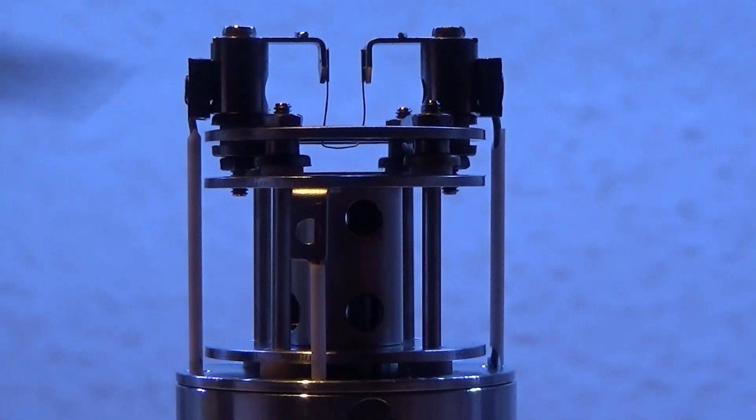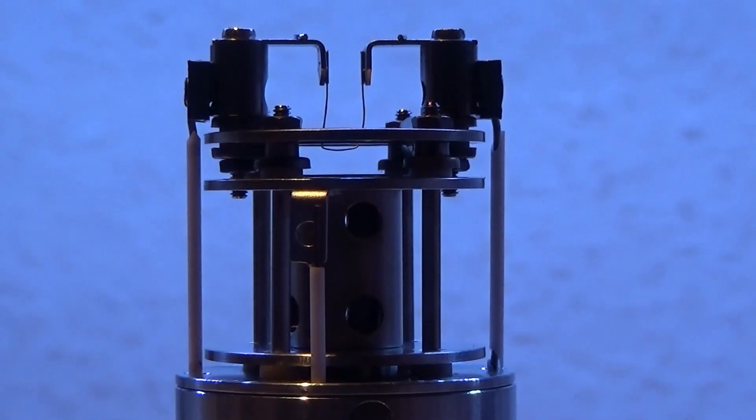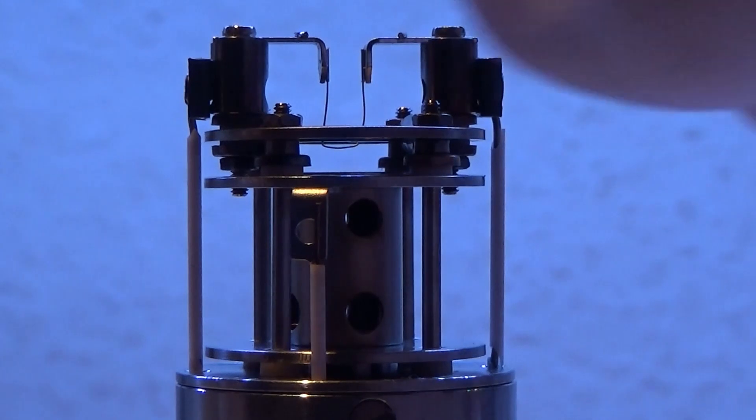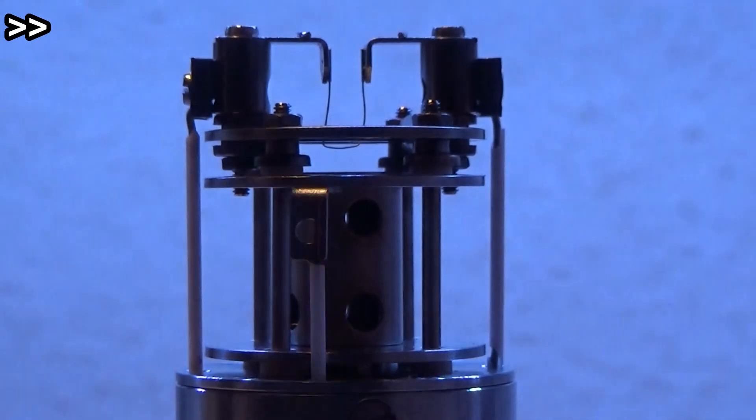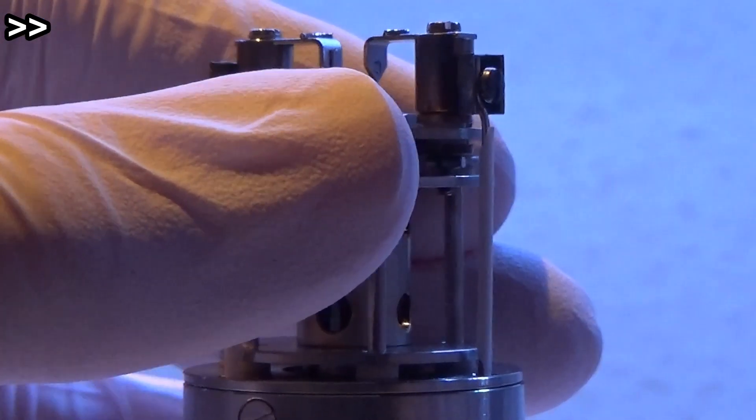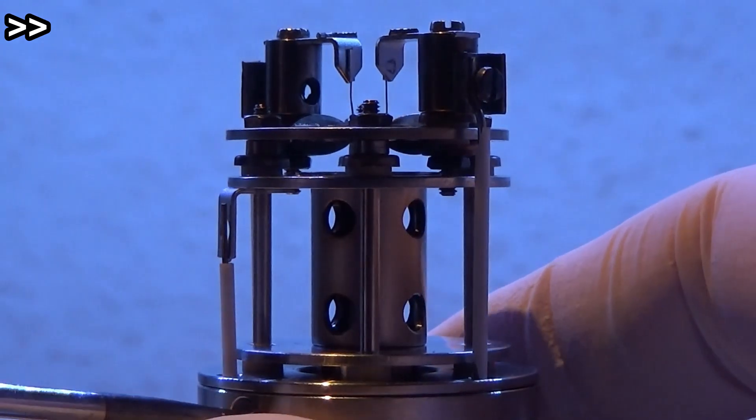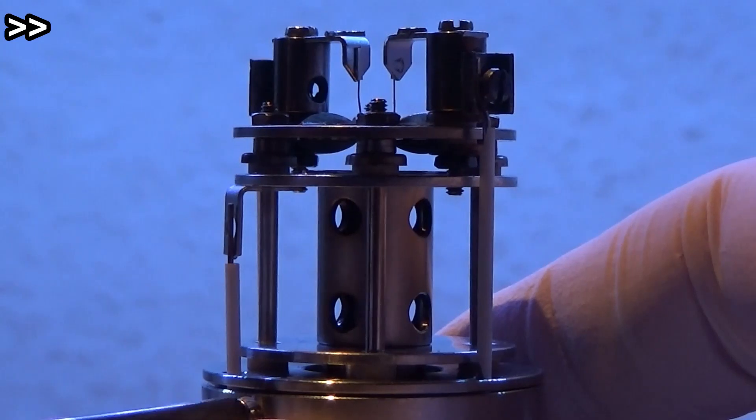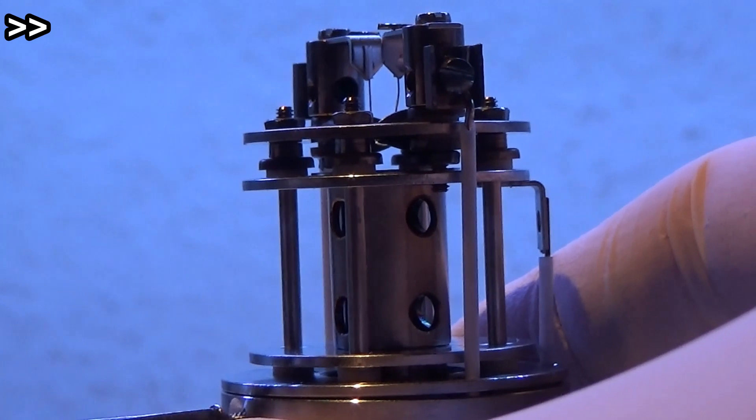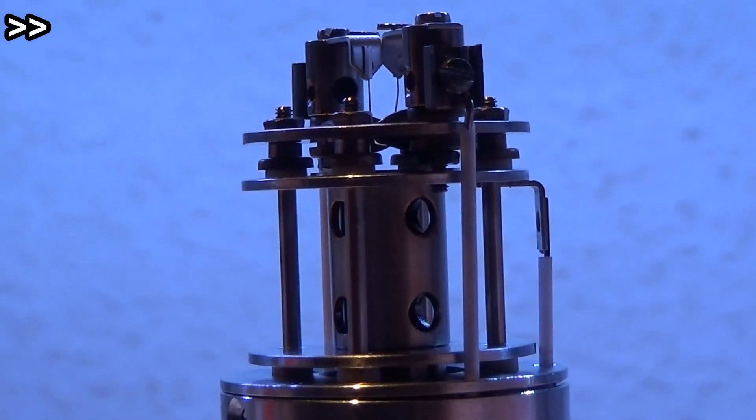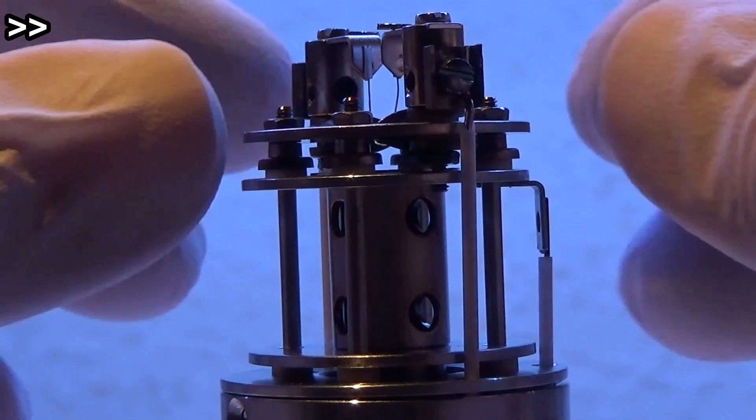The top plate here is also at ground potential, and you can see the wires coming up on either side for the filament. The filament can also be tuned with a small voltage, typically like plus minus 30 volts. Well, let's take this off, shall we?